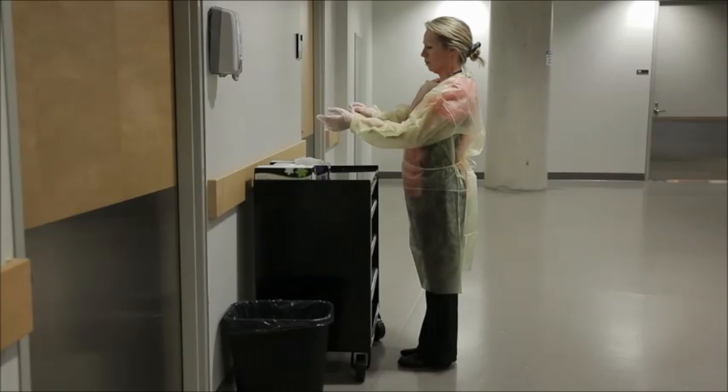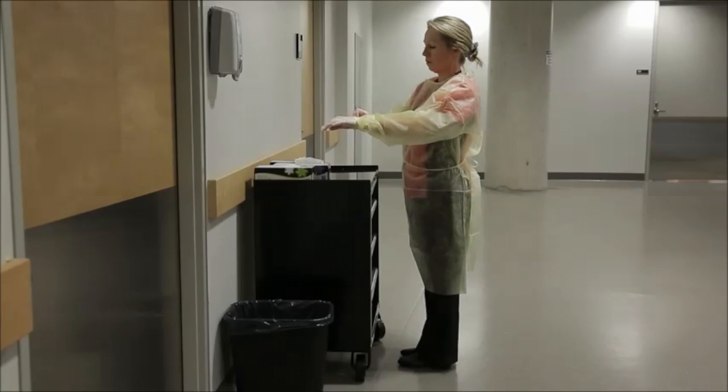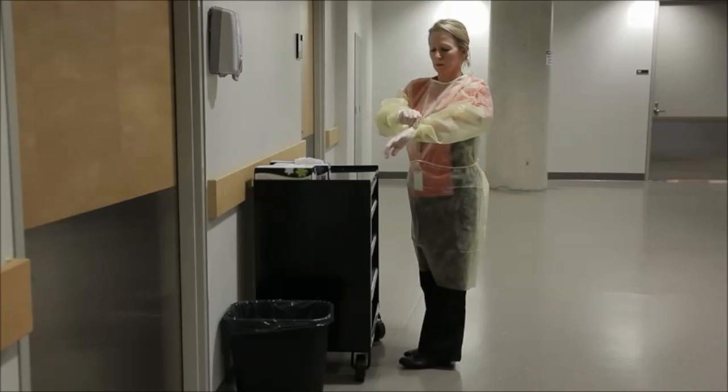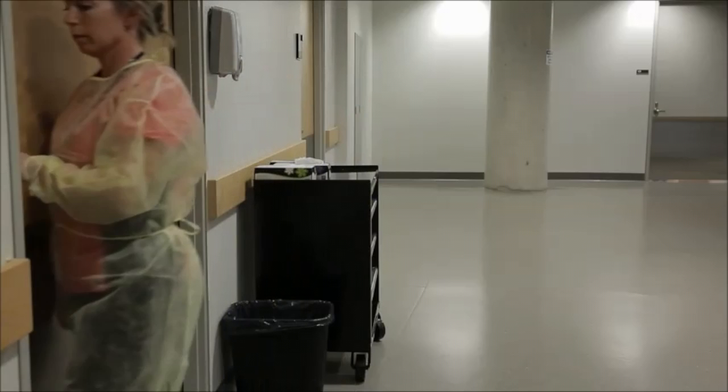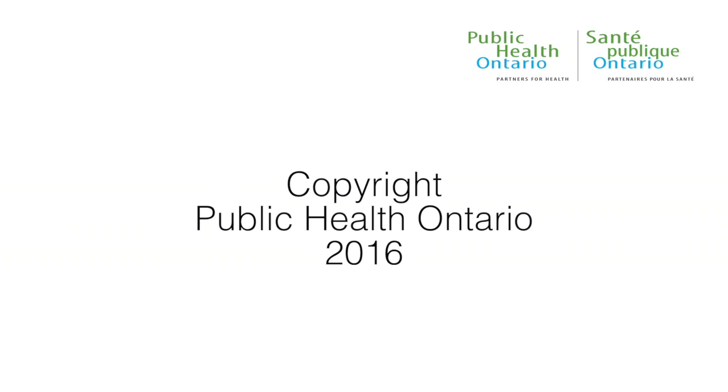If gloves are worn, pull the cuff of the glove over the sleeve of the gown so that it fits snugly.